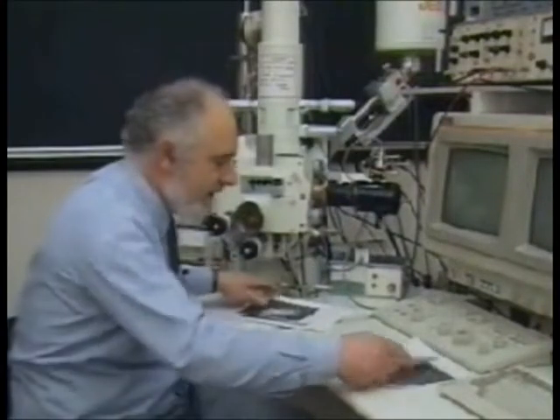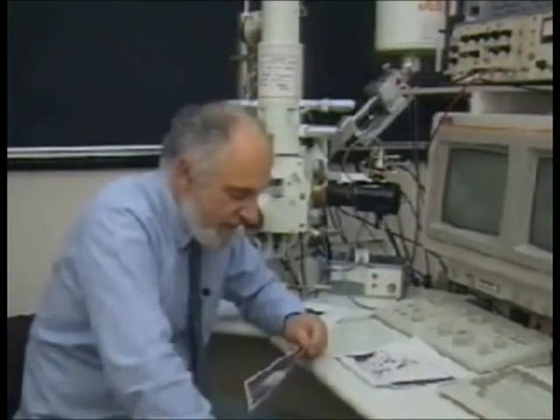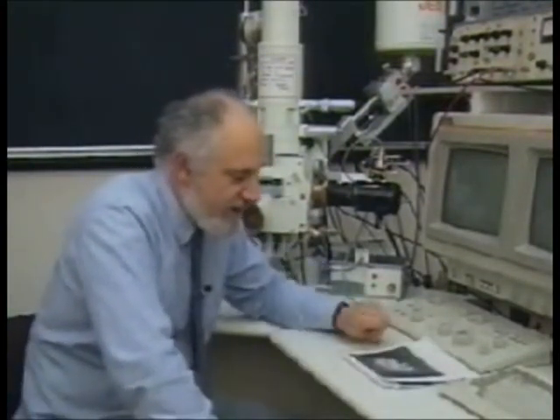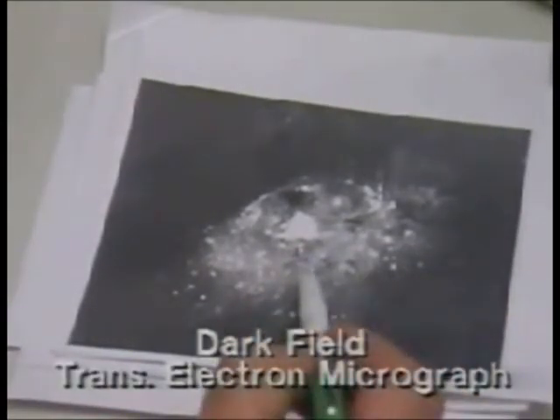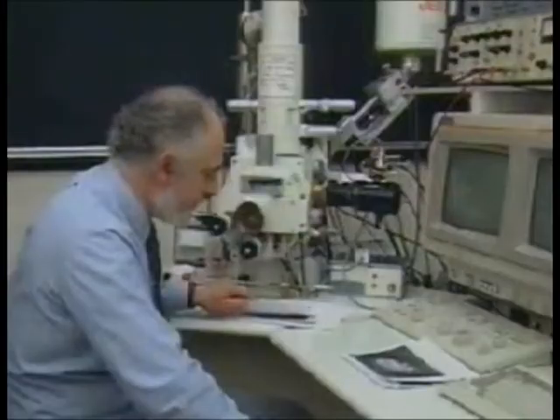Well, we took many electron diffraction micrographs in this way, and here is what's called a dark field electron micrograph, which shows only those crystals which are oriented for diffraction in a particular direction, and that shows the membrane, which is in fact the film, and the small diamond crystals are shining up as little stars inside that membrane.